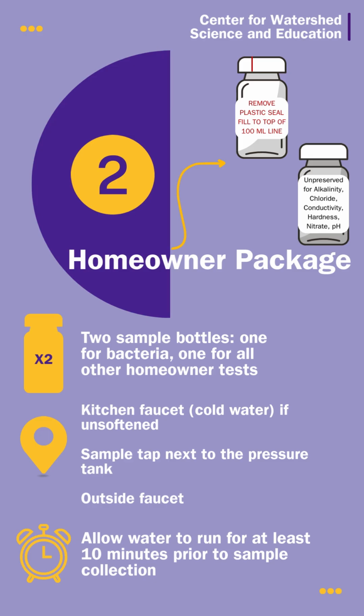Before sampling, remove any faucet screens, aerators, or other attachments. If sampling from an outside faucet, remove any hoses or other attachments and wipe the hose bib with rubbing alcohol to remove any dirt or debris prior to sampling. If you are unsure which faucets are untreated in your home, we do recommend using the cold water kitchen faucet, which is what we are using in the following demonstration.